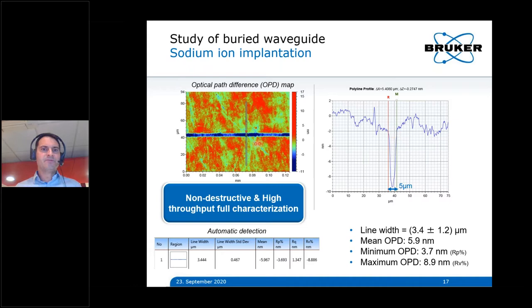However, the key point is what you see is some kind of stronger, lighter blue, which reveals that more or less here the waveguide gets maybe thicker regions or higher concentrations of dopants, and the light path gets actually less.